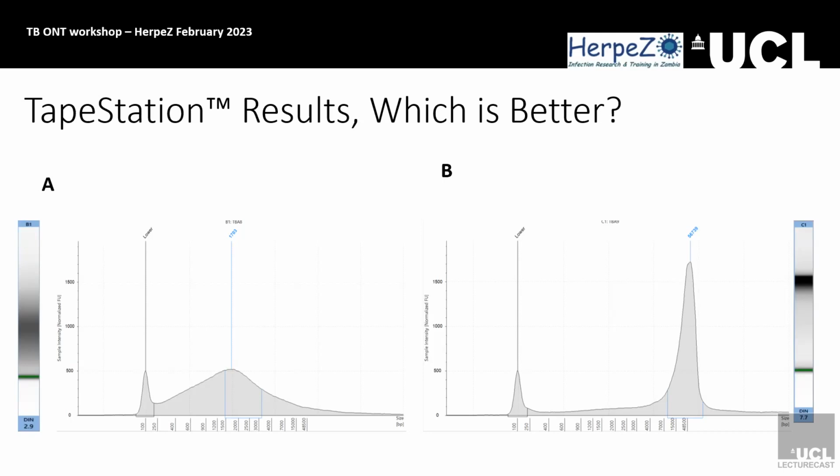It gives an awful lot of analysis, this program. I don't know if the Taiwanese one does the same. Does it give you DINs? Does it give the DNA integrity number score on the Bioptics?